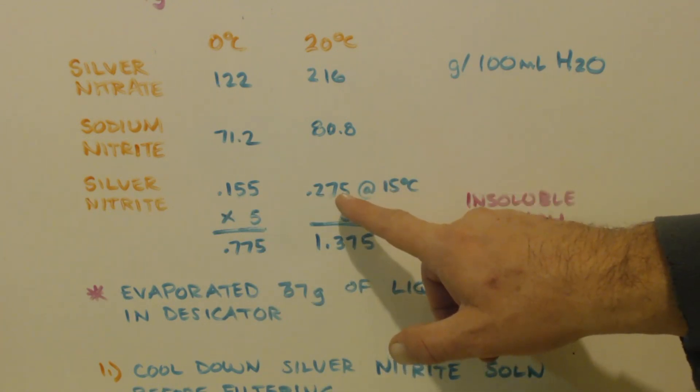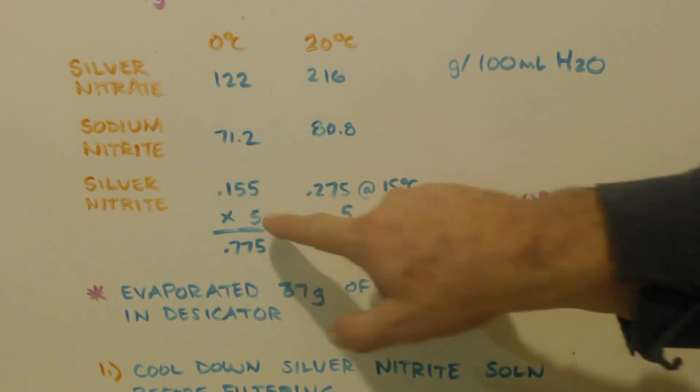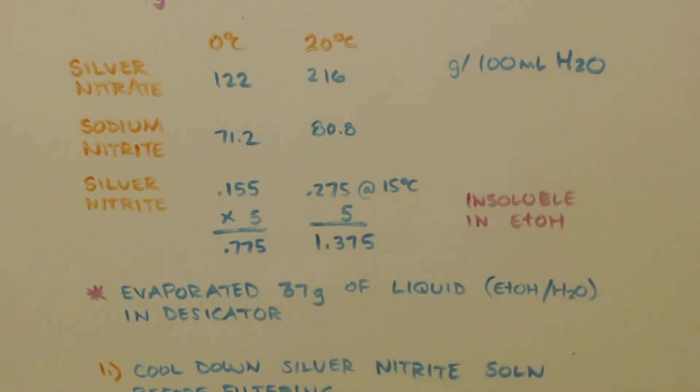I should have cooled it down before I filtered it to make sure that all the silver nitrite would precipitate out. I used about 200 milliliters of water on the silver nitrite and 200 milliliters on the sodium nitrite to get them dissolved. That's 400 milliliters right there, and another 100 milliliters to wash it. So that's 500 milliliters. So I times both of these by five to see how much loss I would get, because that's how much is going to be dissolved in the water. If I would have chilled it, it would have only been 0.775 grams that dissolved that I lost. But I did mine at room temperature, so I lost 1.375 grams. Total, though, my yield, I lost 7 grams. I don't know how I lost so much.